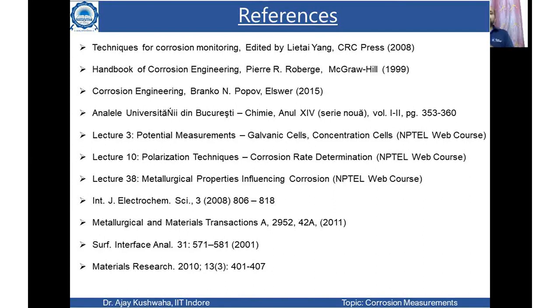In DC current, we are now talking about polarization-based measurement. I just discussed what we mean by electrochemical polarization: when your system is not in equilibrium, due to some applied current there is polarization in the electrode, then we consider that we have electrochemical polarization.